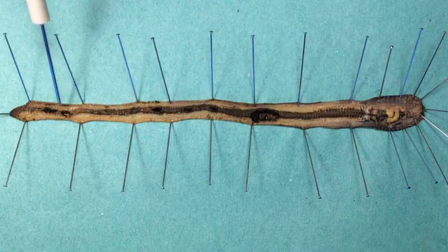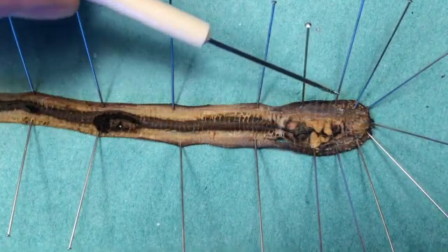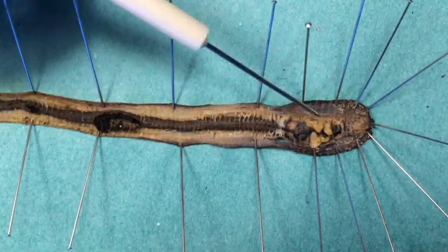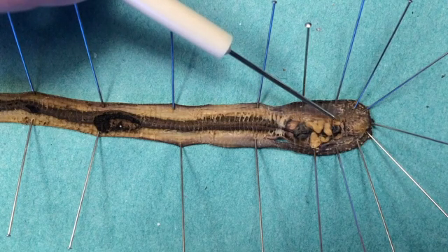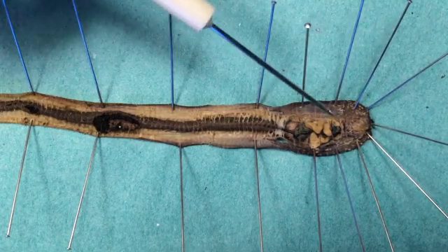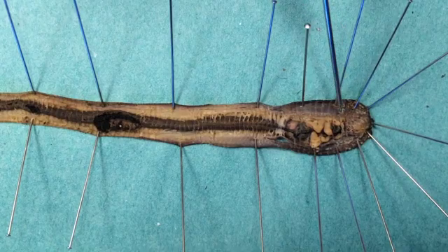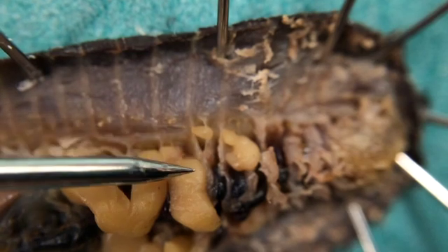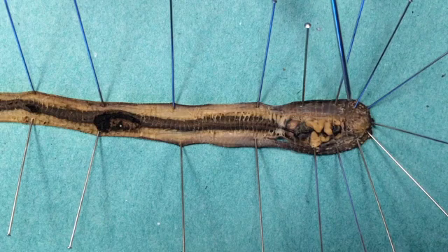We have a very short hindgut and the anus right at the end. Now looking at the reproductive organs — the most obvious part of the reproductive system are these three pairs of seminal vesicles: a very large posterior seminal vesicle, a smaller middle seminal vesicle, and a smaller still anterior seminal vesicle, which contain developing sperm. You may also notice the seminal receptacles, which are little round structures — that's where sperm will be deposited by a worm with which it has mated, so those are the sperm storage chambers.